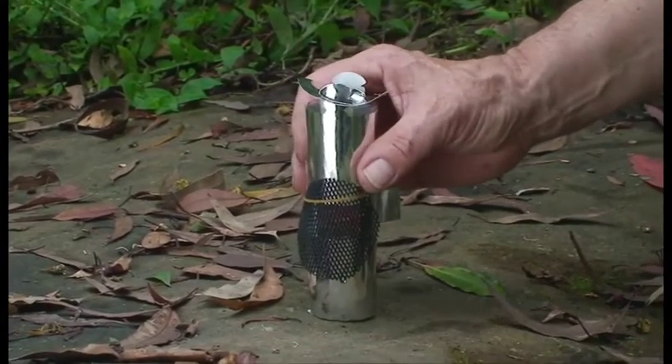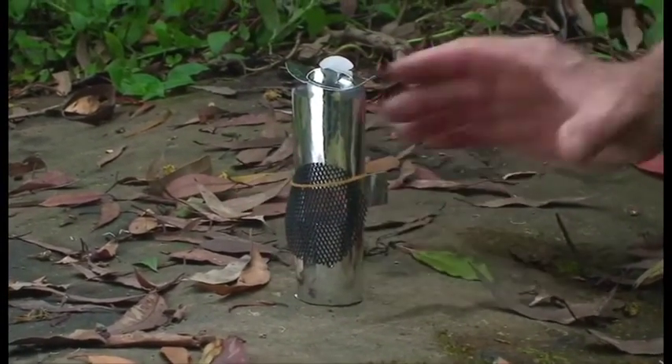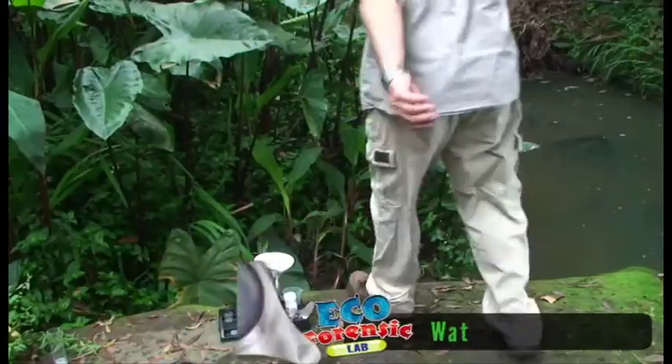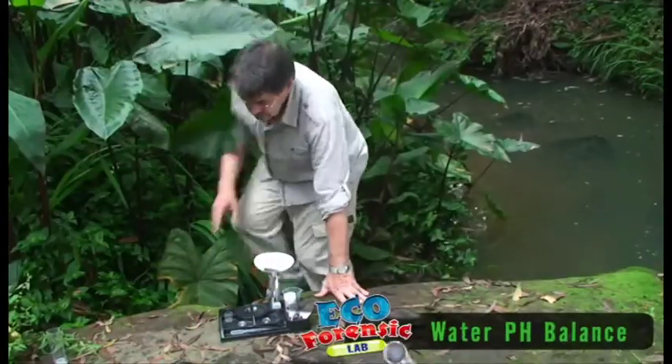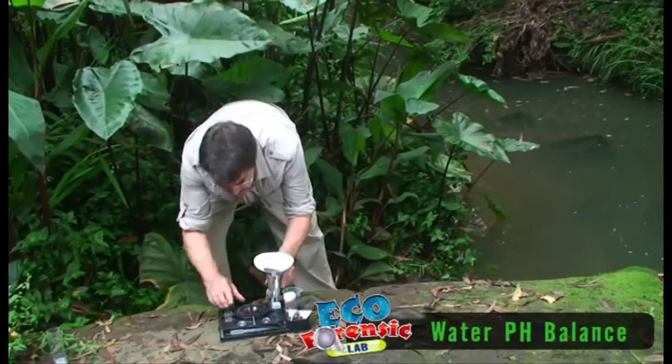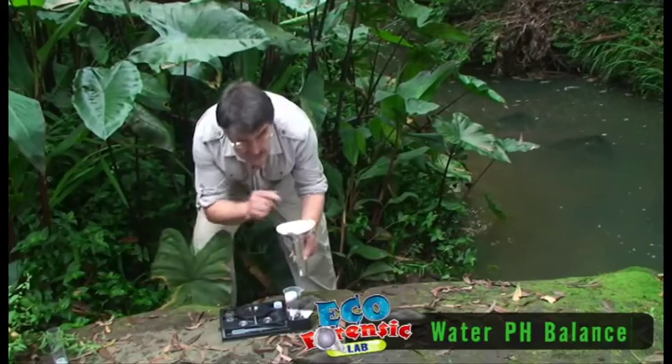Now I'm going to take these little creatures and find a sunny place. This spot I know is going to be pretty sunny — I'll leave it there for about an hour. Now it's time to measure the pH of our water sample. First of all I'll move our Burlesi funnel out of the way.